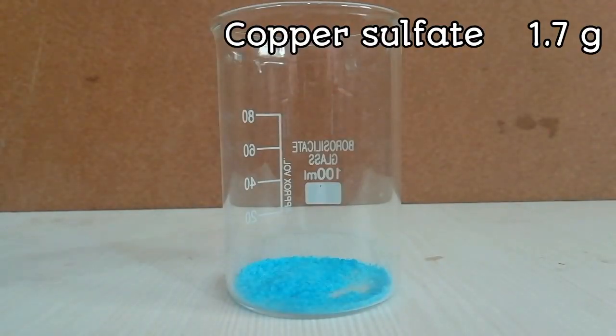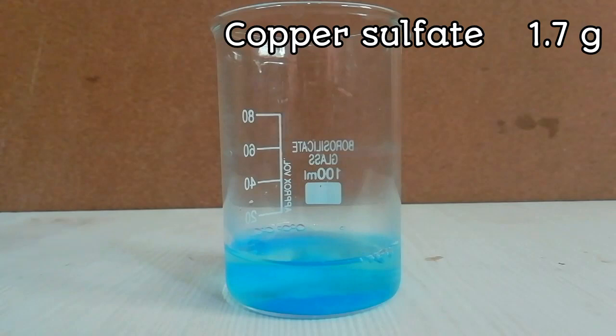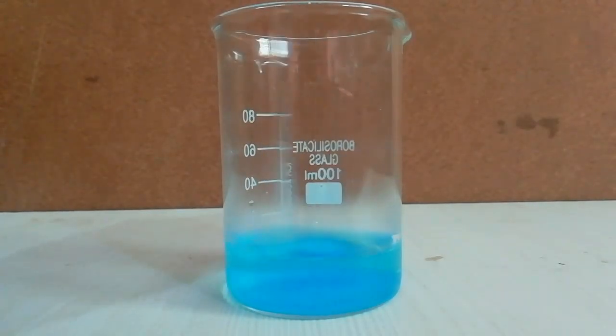First, add 1.7 grams of copper sulfate to a beaker and dissolve it in 20 milliliters of distilled water.